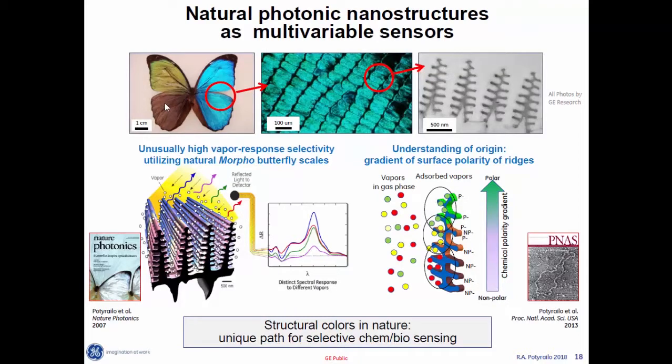If we take the butterfly and replicate the experiment that was done a little more than 100 years ago at Cornell University, you can put different solvents on the butterfly wings to see what is the matching refractive index that removes the iridescence. I reproduced that experiment just to see that the color change is quite dramatic, from blue iridescence to yellow or green. But when you are exposing it to different vapors, those changes do happen, but they're much smaller.